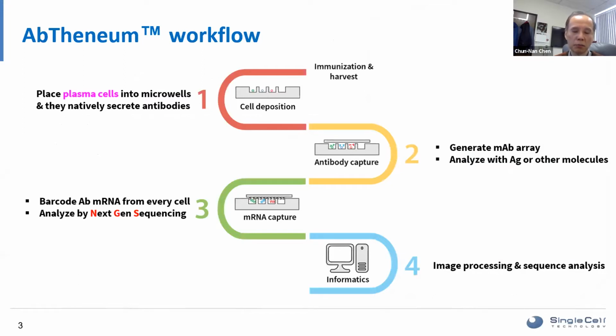It is broken down into 4 parts. The first part is, after the immunization, taking the hyperimmunized animals, taking their lymph nodes and making them into single cell suspensions. We use a kit based on the CD138 marker to enrich for plasma cells. These cells are terminally differentiated B lymphocytes that will secrete antibodies natively at a high rate, up to 2,000 molecules per second. So they really crank out these antibodies. And we go clonal from the very beginning.